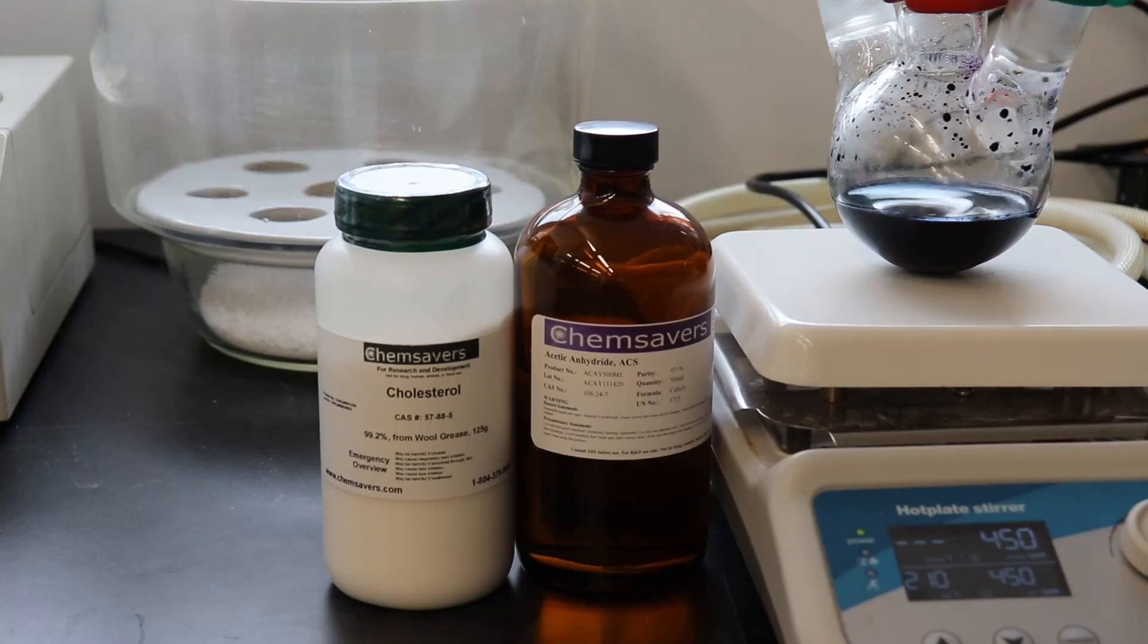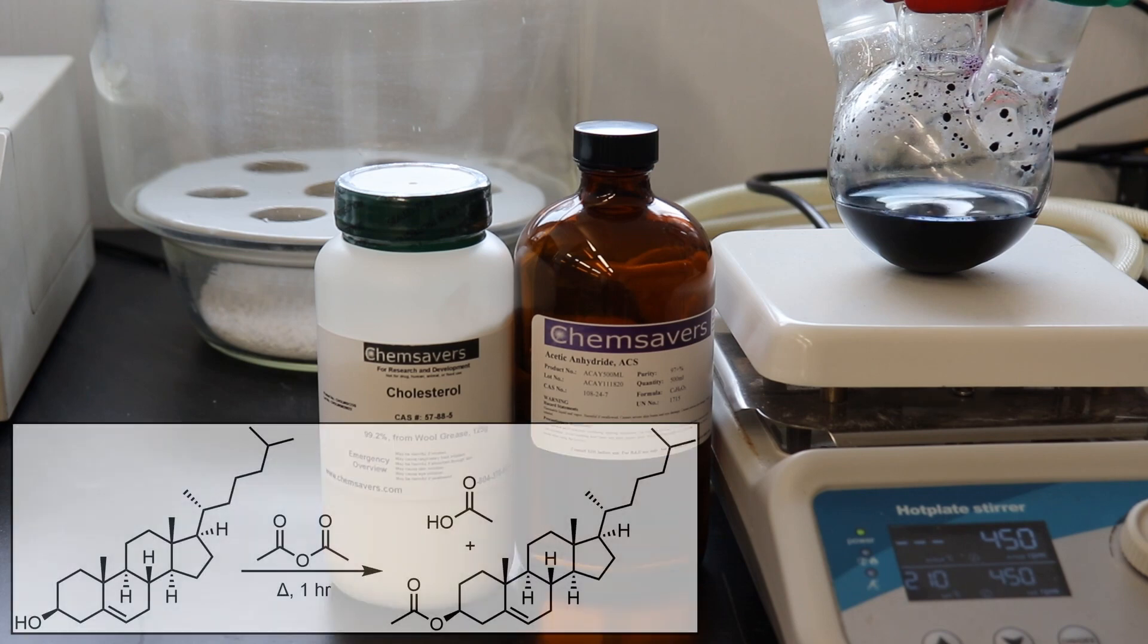In this video, I will demonstrate the esterification of cholesterol with acetic anhydride to form cholesterol acetate. The acetylation of the alcohol group serves to protect it from unwanted reactions when doing chemistry at the alkene.